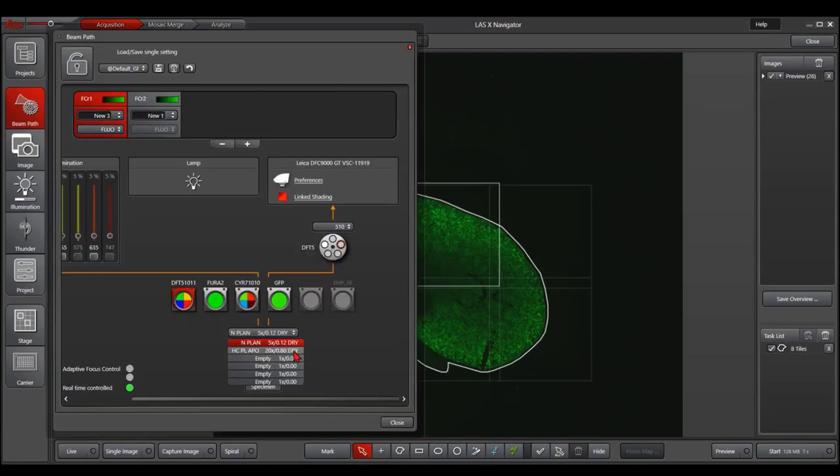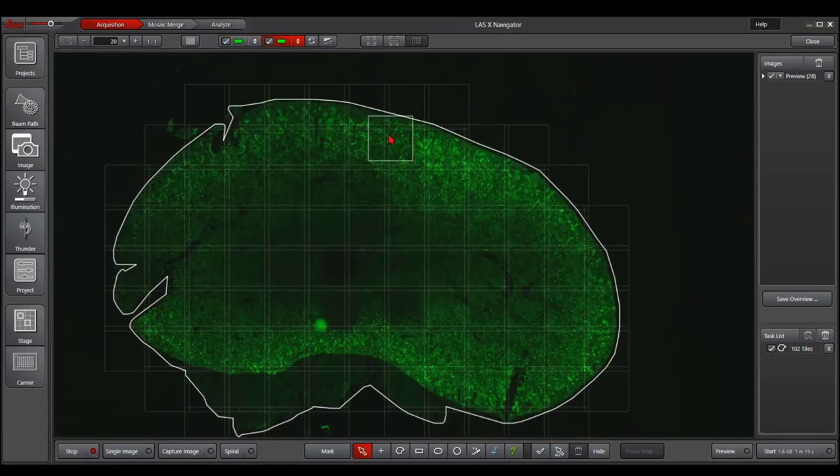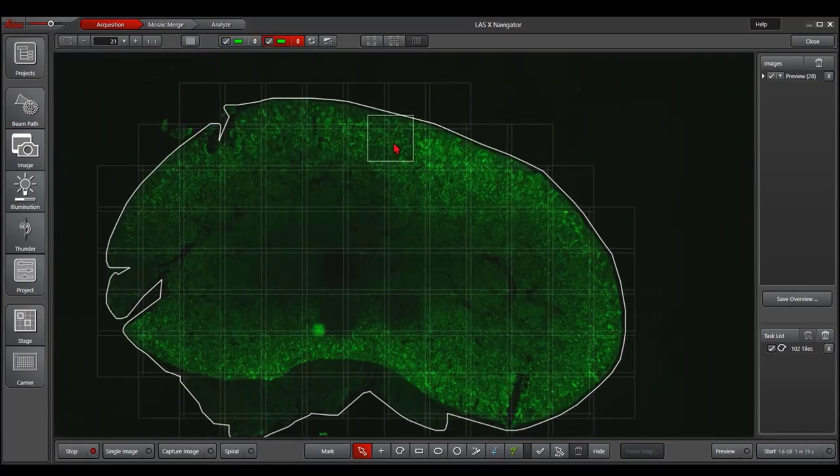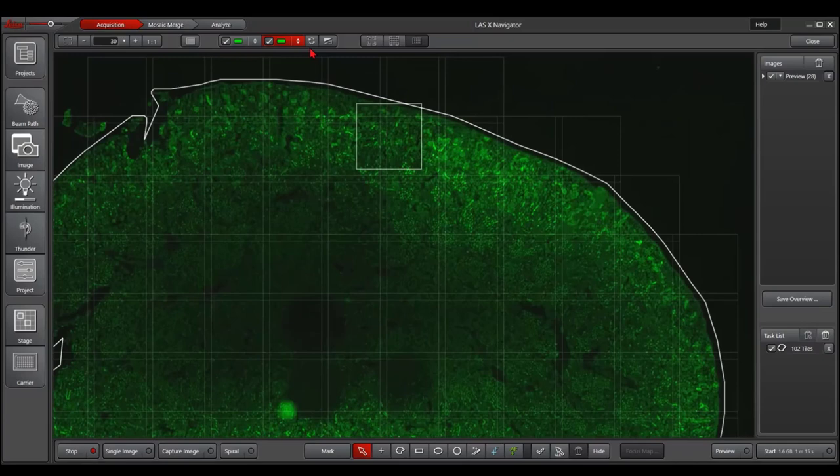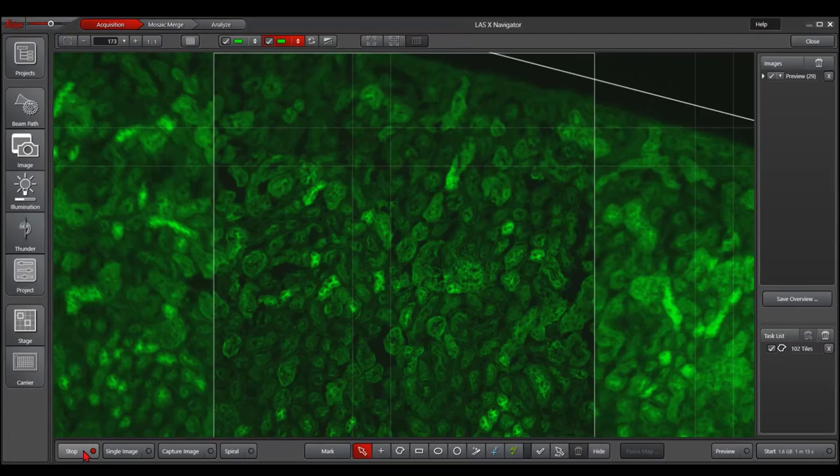After we switch to the 20x, the region of interest will be automatically updated. Most importantly, when you zoom in to 20x, it will be pretty good in focus. Then you can continue with your navigator experiment.